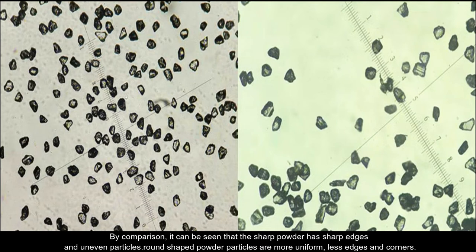By comparison, it can be seen that the sharp powder has sharp edges and uneven particles. Round-shaped powder particles are more uniform, less edges and corners.